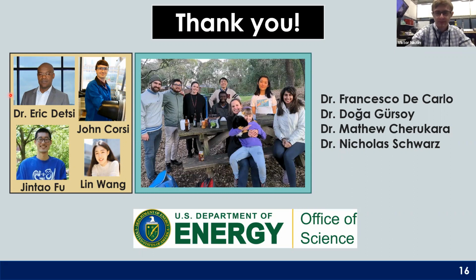Can you hear me? Yeah. So I'm Victor, from the imaging group here at APS, working with Francesco, and I also work quite some time with the TXM data and with this alignment problem. Have you thought about implementing some other alignment algorithms? In our case, we are doing fly scan, continuous scan, and we don't have this jitter problem. The sample is just moving in one direction. When I tried one of these projection-based alignment algorithms, they typically don't work in 90% of cases. So some other, more advanced algorithm could help.